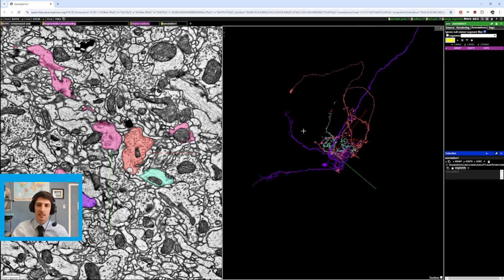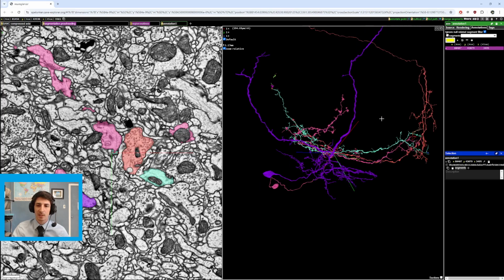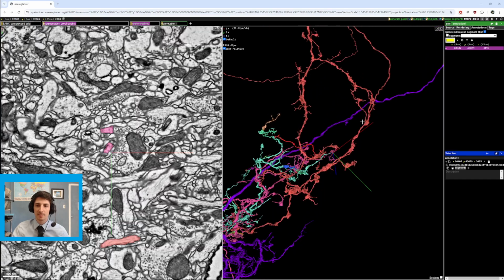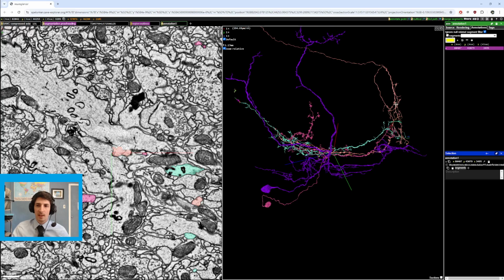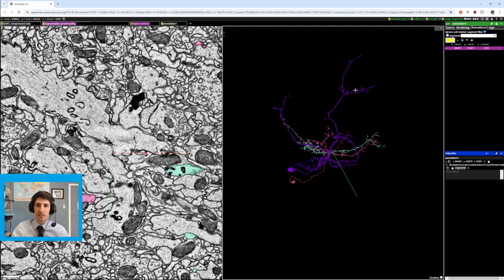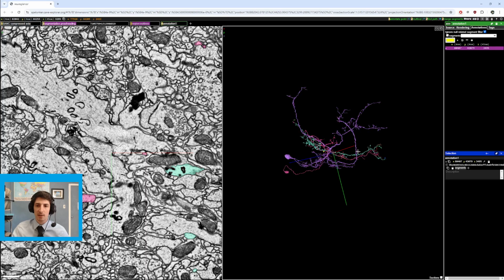As you can see, this soma comes out of the middle of this bend. So it's not coming out of the tips, which would be like here and here on that orange one. And similar for this purple one, the soma is not coming out of these little feet over there, and it's not coming out of these arms.